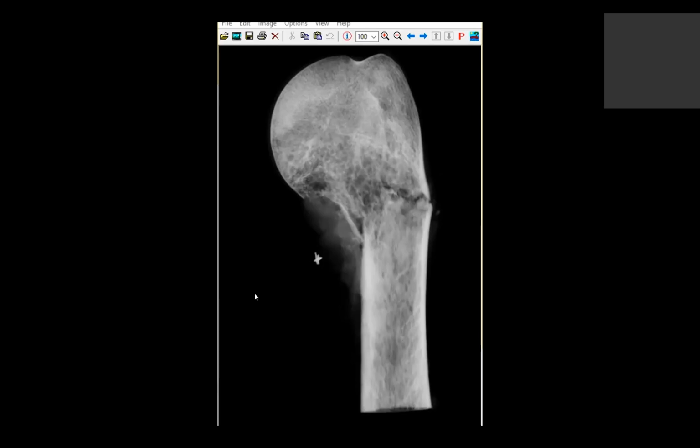Great, and so the purpose of the X-ray is to guide your dissection, how you want to approach the specimen. It also helps identify if there's any metal in the specimen, because depending on the type of resection, there may be a lot of different types of hardware attached to the specimen, which will make it a challenge to put through the saw for obvious reasons.